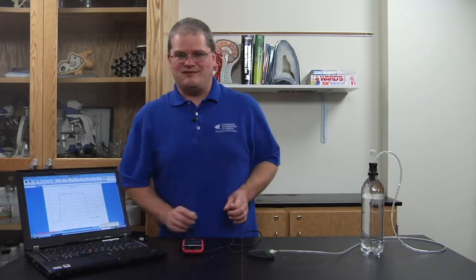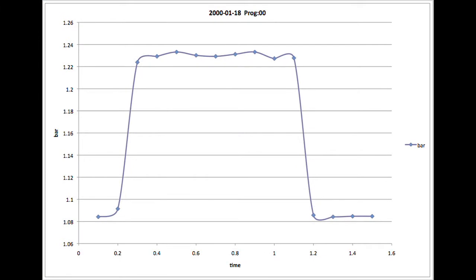And as you can see, we have a very easy graph. It's already come up. If you take the average of this range, that will give you your pressure necessary to maintain neutral buoyancy.